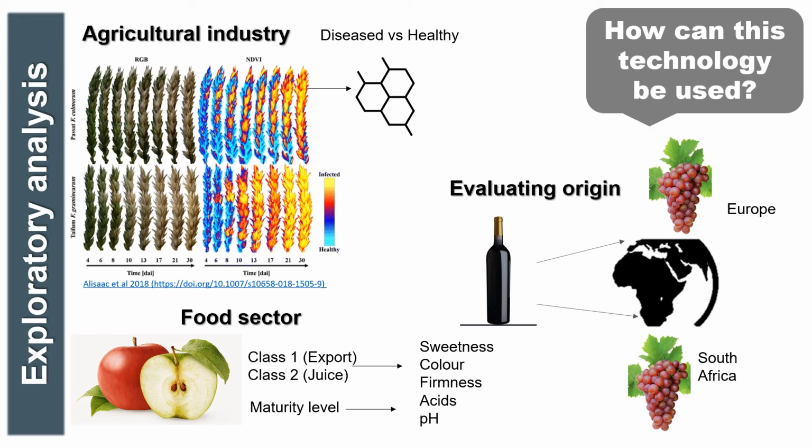Exploratory analysis therefore allows us to evaluate if we see certain patterns or trends in the data which are created by differences in their chemical or physical properties.